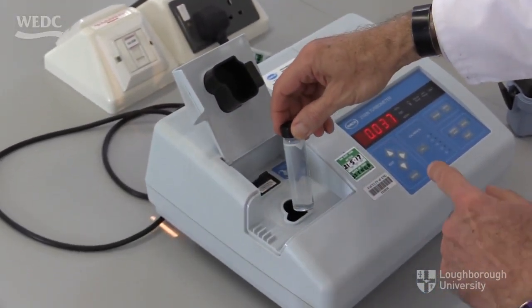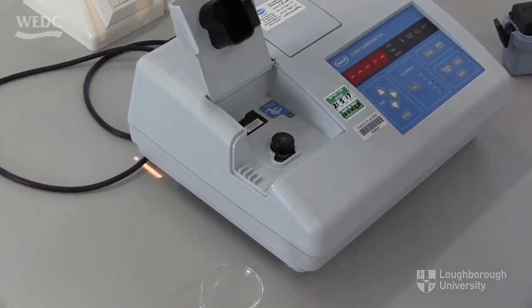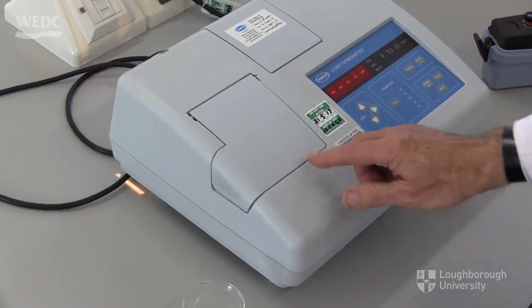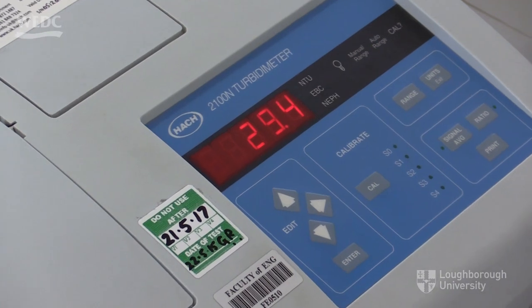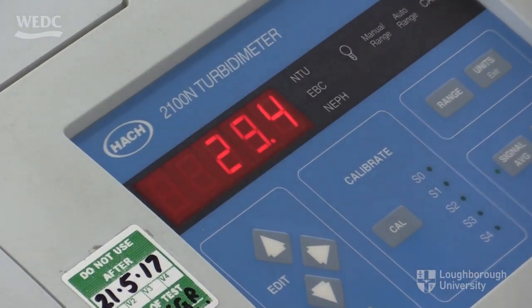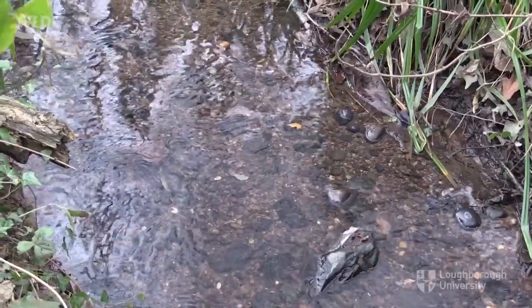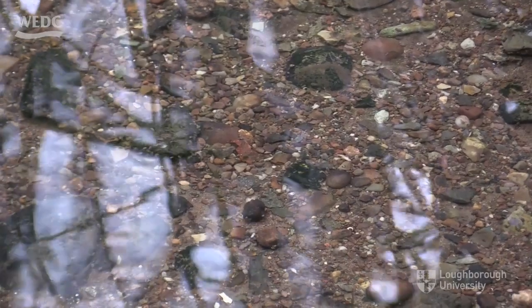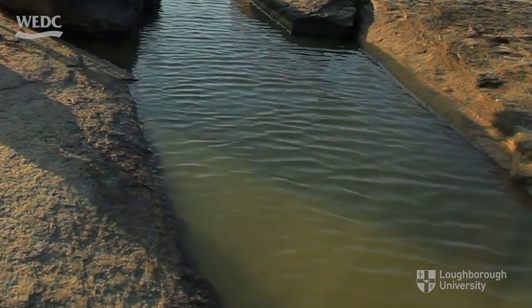Opening the lid of the turbidity meter, place the sample tube into the circular slot provided in the machine, with the white triangle still facing towards you. Close the lid and wait for the turbidity reading to appear on the display. In this example, it records a reading of 29.4 NTU, which is reasonably clear. Water with a reading less than about 30 NTU could be treated by filtration without causing too many problems. Water having a turbidity of more than about 30 NTU can cause filters to clog.